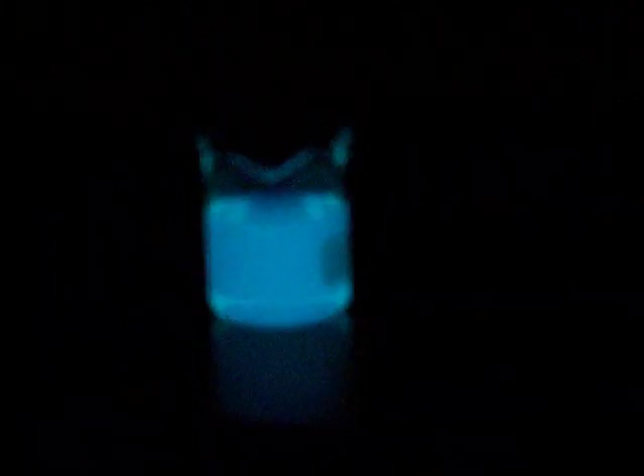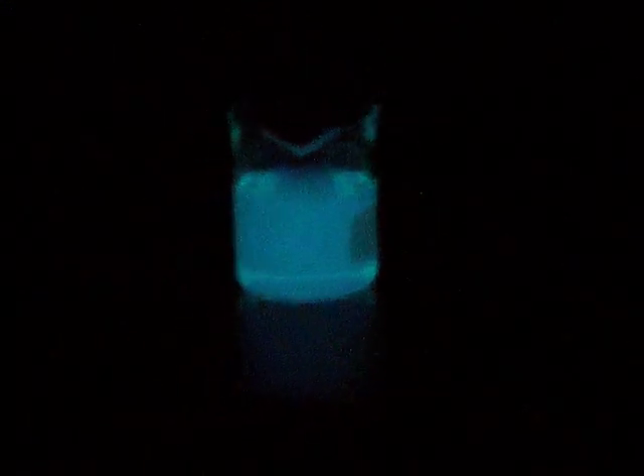What do you see? It's like a neon glow. What do you see? It's just pulsing. Come up close.